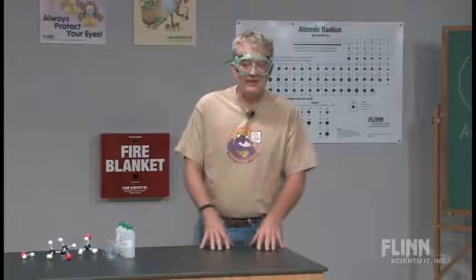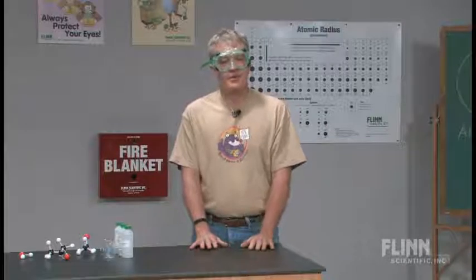It still involves throwing some liquid, which in some cases might bother you a little bit because throwing chemicals is a problem occasionally, but I find it to be a really nice illustration of evaporation rates and vapor pressure. So I still like to use it, and I also like to use it because it gets a number of students involved in the process.